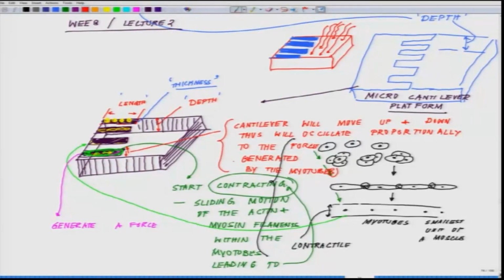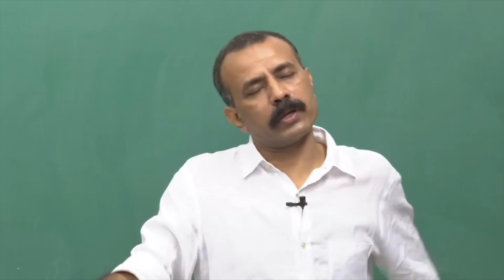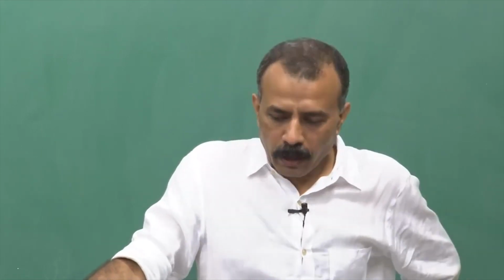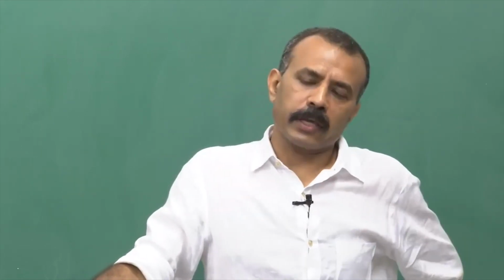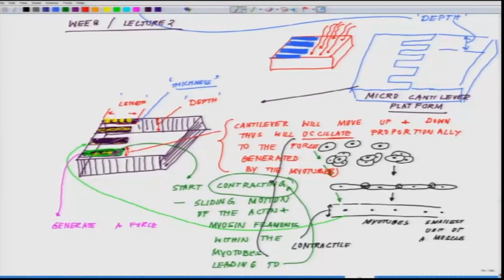Depending on the force generated by the myotubes, there will be a certain oscillation happening here. This oscillation is directly proportional to the force generated. These two words go hand in hand.